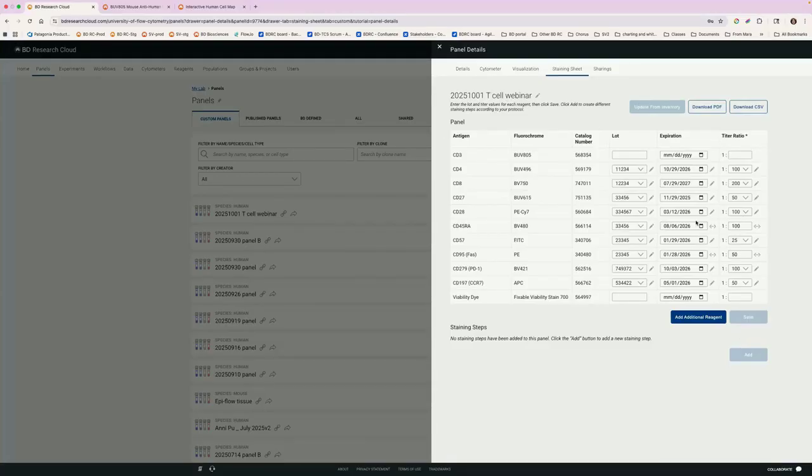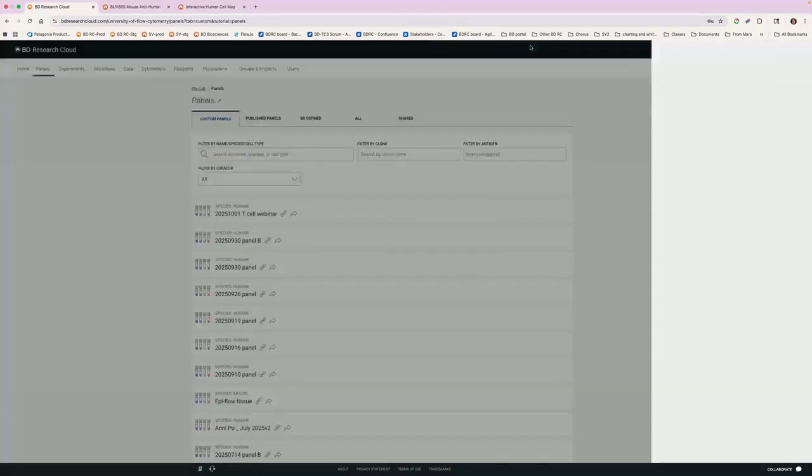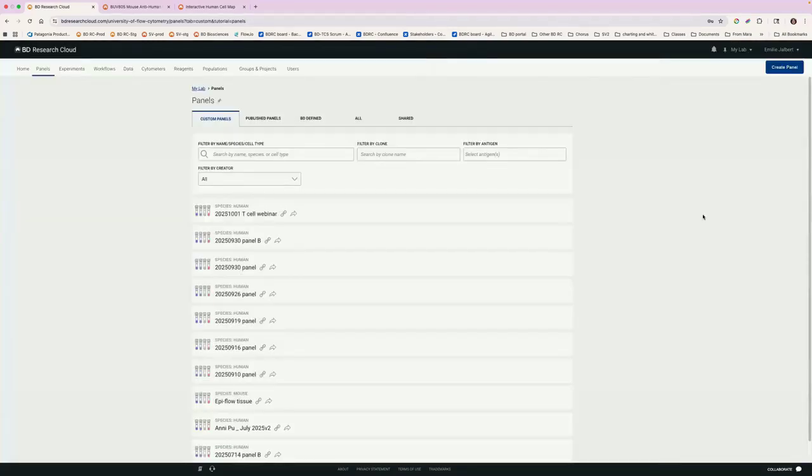I won't go into detail about how to create staining sheets, but if that's of interest to you, feel free to reach out to me anytime. Happy to walk you through. Or if you want to watch one of the webinars, we explain that more in detail there as well.